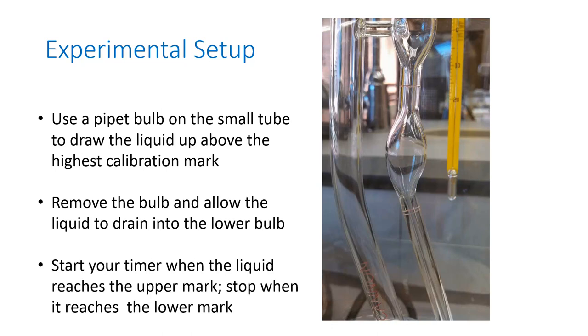So when the liquid is passing the top mark, your eye will be a little higher. Bring your eye down to the level of the lower mark to when you're ready to stop the timer. This is the same rule that goes for reading a burette, if you have experience with that.